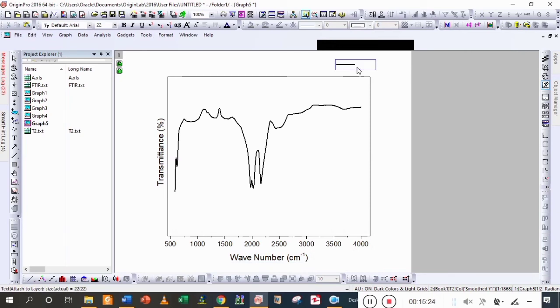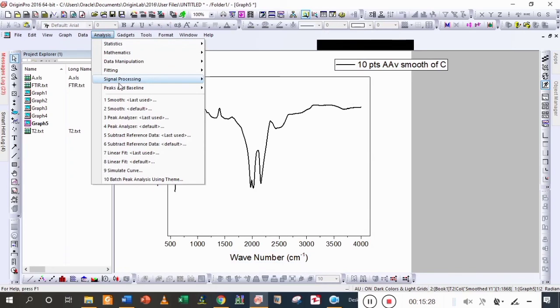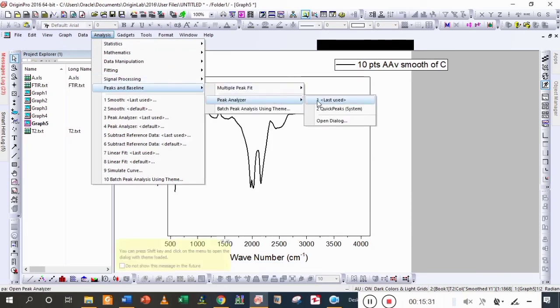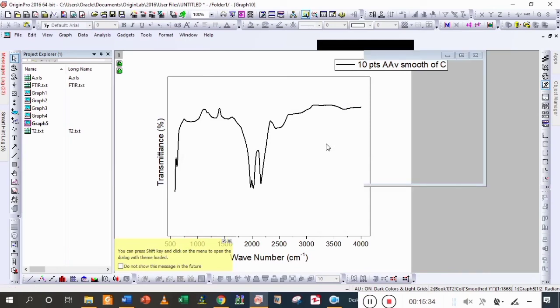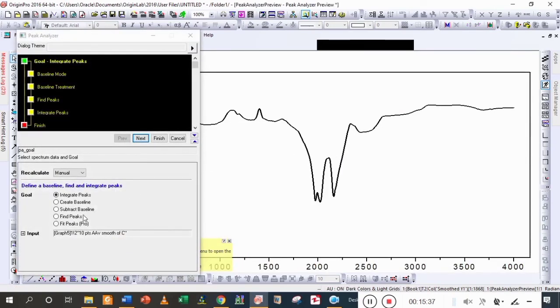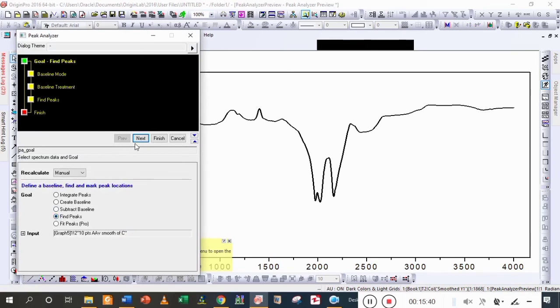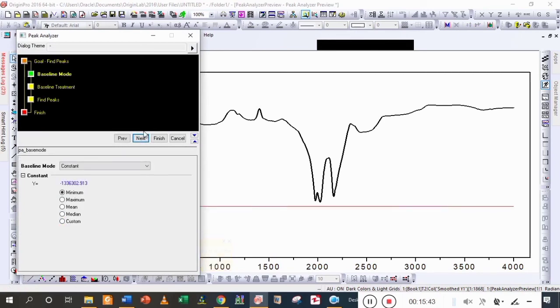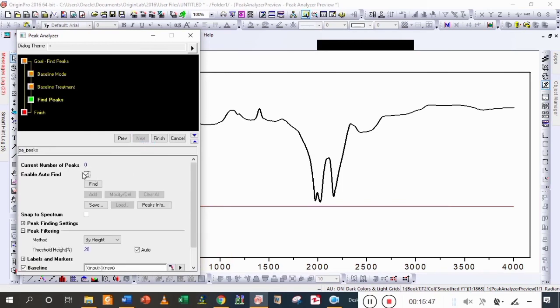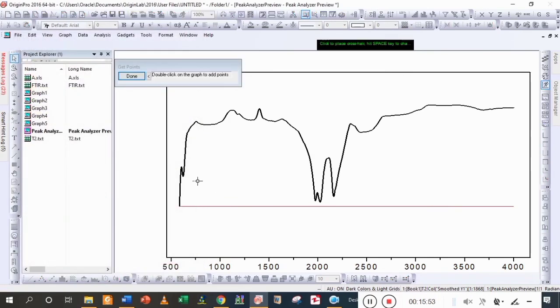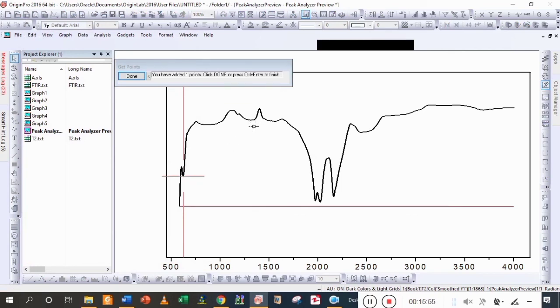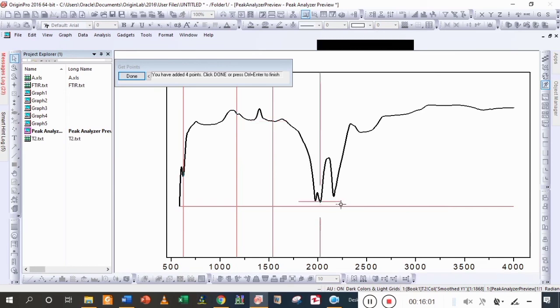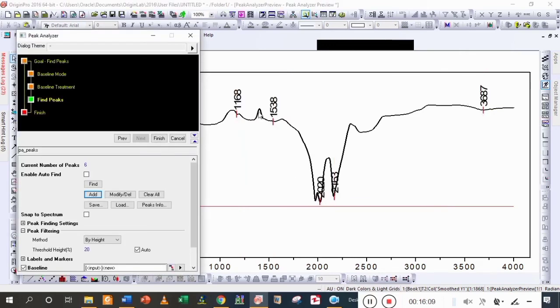Let's change the title, but first we will use the peak analyzer dialog box to mark some peaks. Click on Find Peak, then click Next, Next again, Next again. Click to enable auto-find — actually I'm not going to use auto-find, so I'm choosing the Add button. According to your peak values, you can add the peak values manually, then click Done and then Finish.